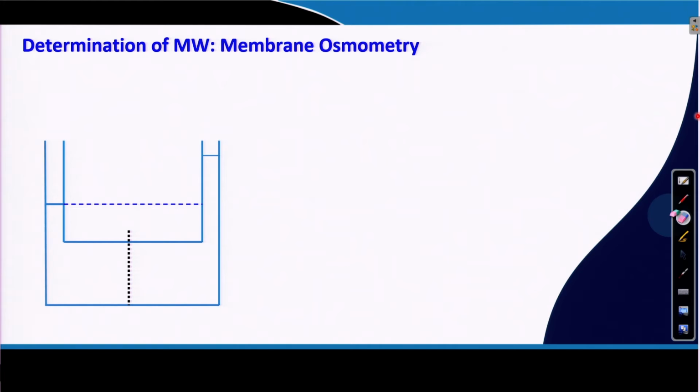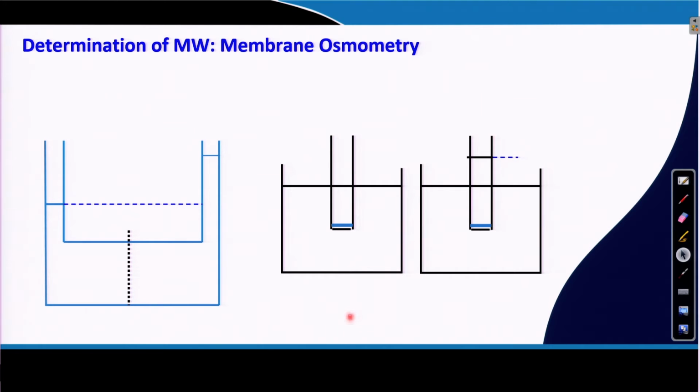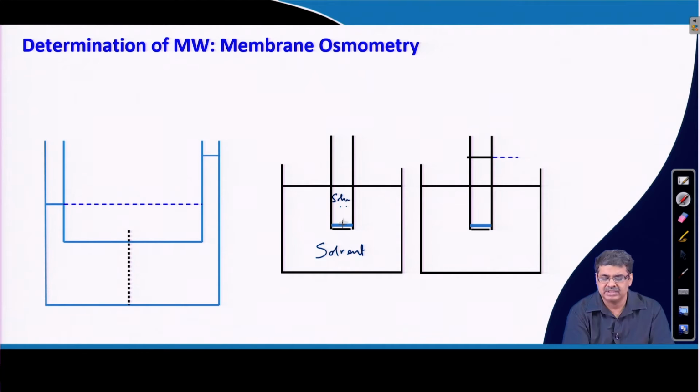So, osmotic pressure is the additional pressure required to maintain the equilibrium between the solvent phases. Now, we can have other types of setup where we have solvent outside and solution within, separated by a semipermeable membrane. On equilibrium the height goes up, and this pressure, given by h d g, corresponds to the additional pressure pi, which is called the osmotic pressure.